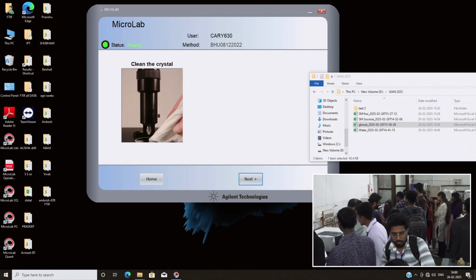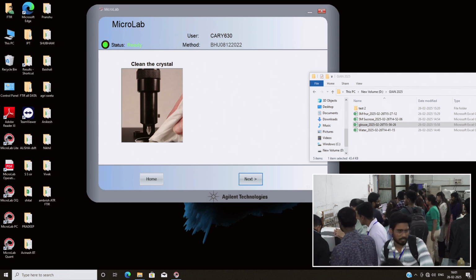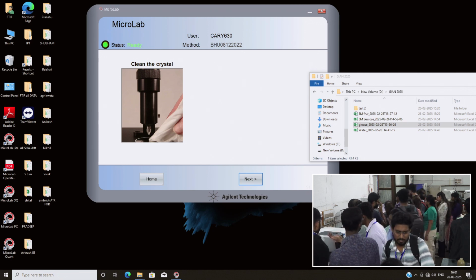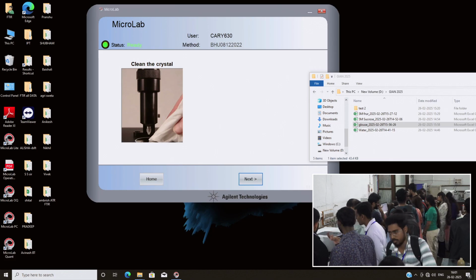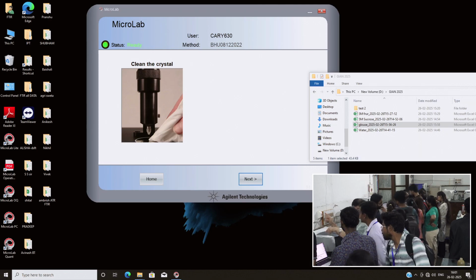Yep, the peak position is different. If the structure is different, then the peak position is quite different. Galactose and glucose are both monosaccharides, differing only in the direction of one group, but the spectral pattern is quite different.